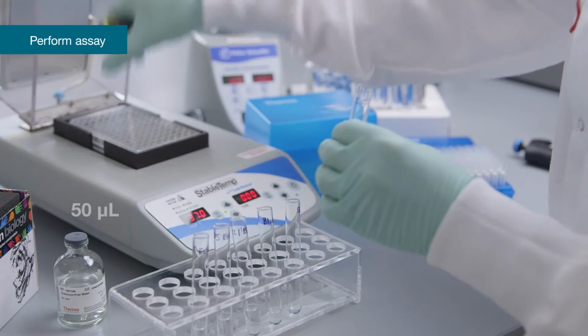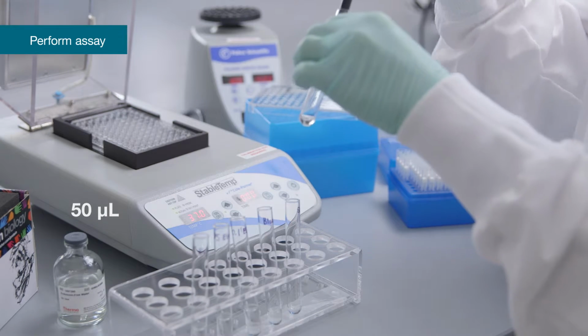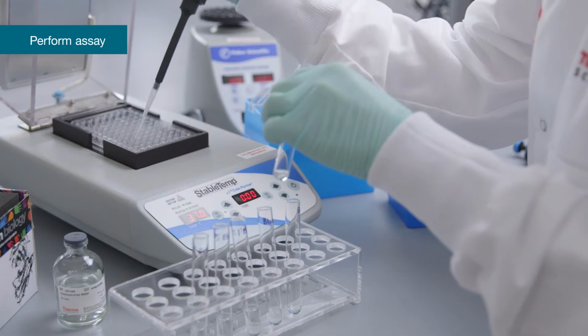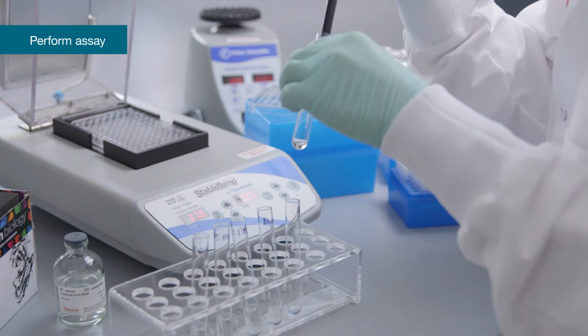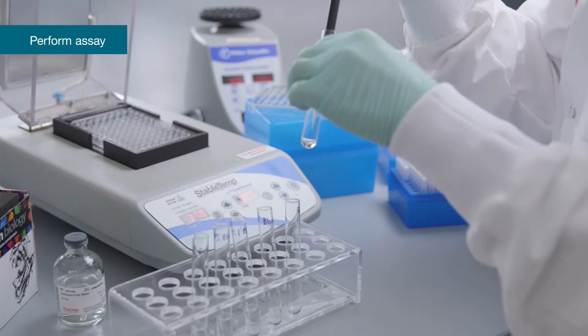Add 50 microliters of endotoxin standard dilutions, blank, and samples per well in triplicate. Ensure pipetting order and rate of reagent addition remain consistent from well to well and row to row throughout the procedure.